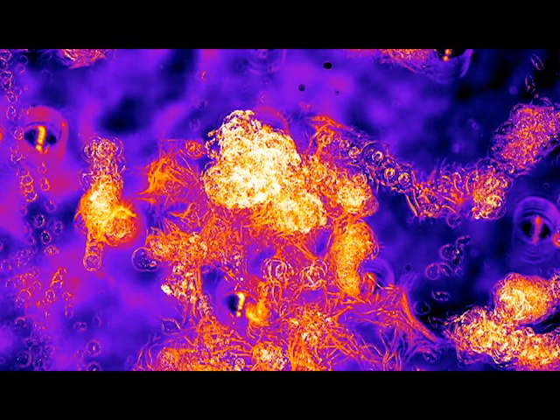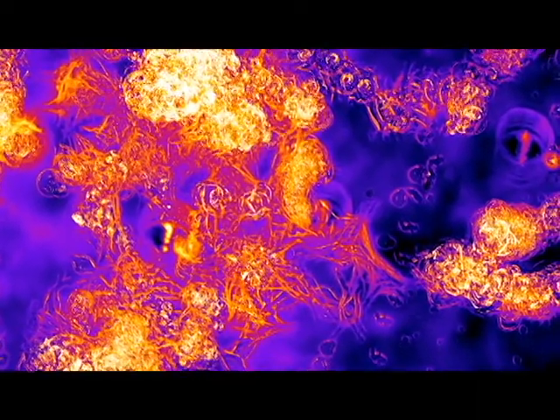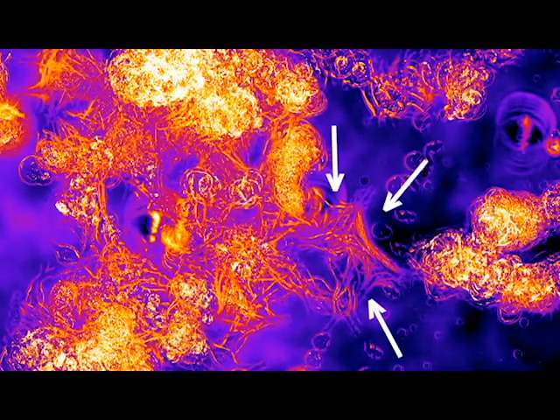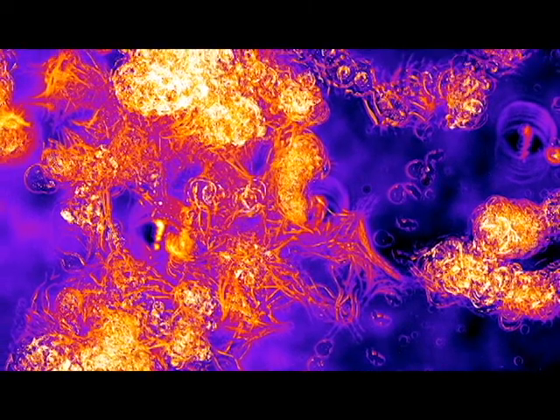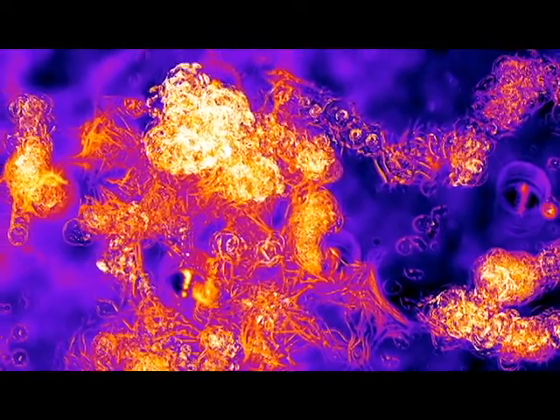We can see here an area where the cells are really still roundish and balling up, and here you have a lot of stretchy stuff going on—cells are changing shape very rapidly over time.